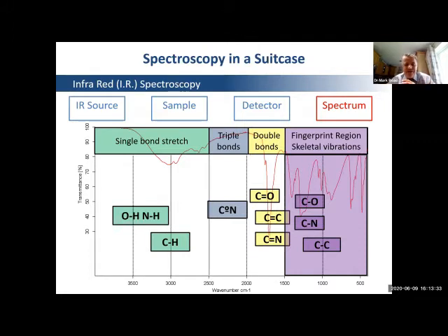So when you look at the infrared spectra, we typically look at peaks that are above about 1500 wave number, because here we have clearly defined and uniquely assignable peaks, and you look them up in the lookup table. However, you can see the purple region on this diagram below 1500. Usually it's a little more complex. Some of the peaks coalesce, they merge into each other, and they're usually a more complicated pattern.